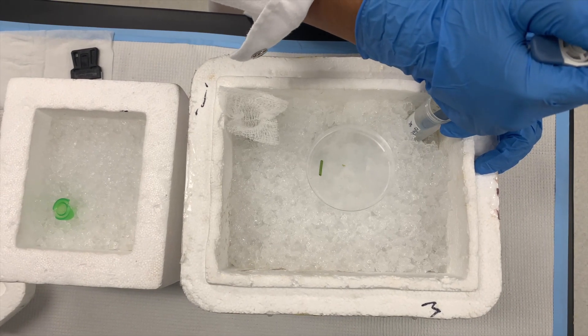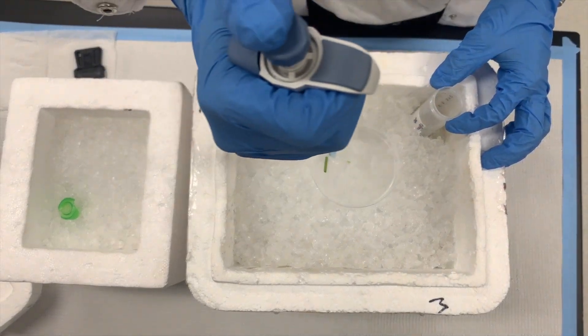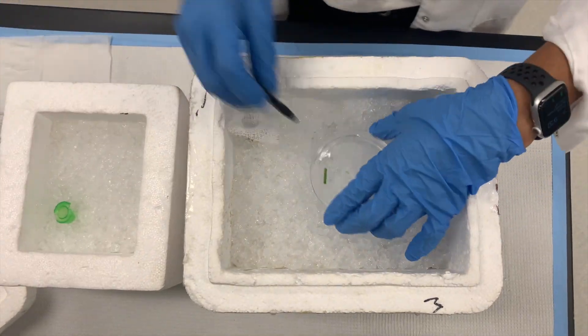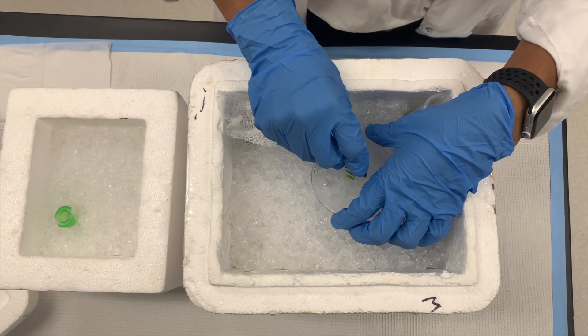To begin this process, we will want to keep everything as cold as possible. If you have access to a walk-in cold room, use that. Otherwise, you can use a bed of ice and petri dishes you stuck in the freezer.